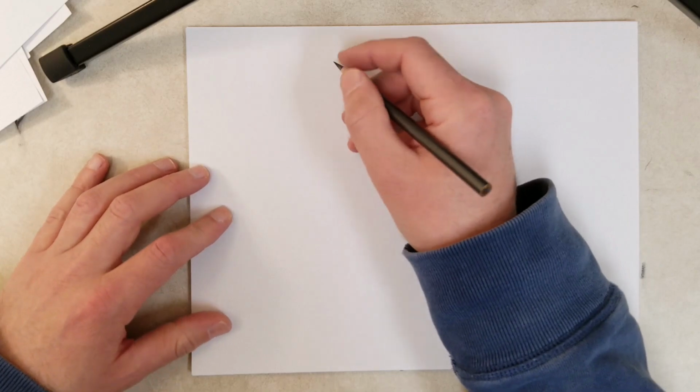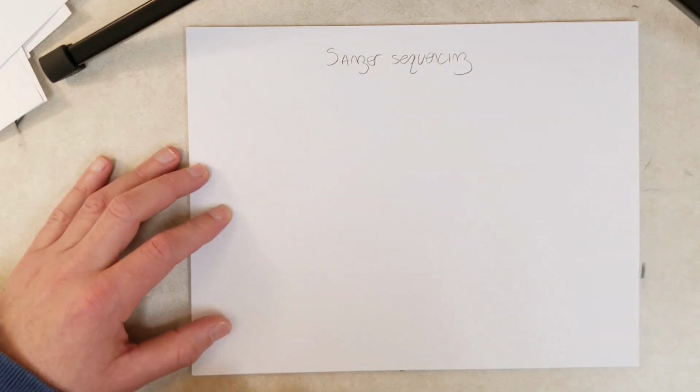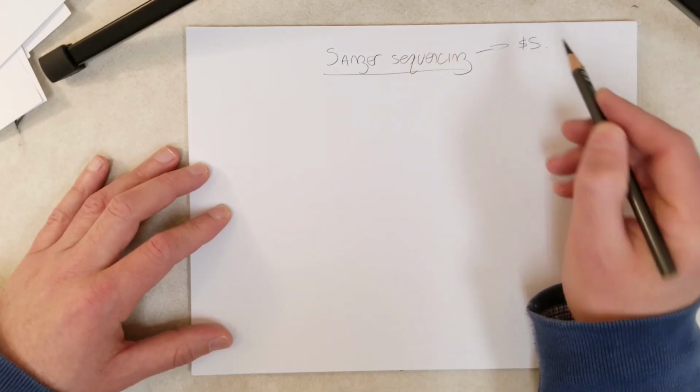Hey everybody, in this video we will talk about Sanger sequencing, which is a really common technique in genetics. Essentially, if you want to determine the sequence of a DNA molecule that you need 1,000 base pairs sequenced, you would use Sanger sequencing. We talked about some other technologies for genome sequencing, and you wouldn't use those for a simple 1,000 base pair molecule. You would use this, and this is pretty cheap. You can get this done for like $5.